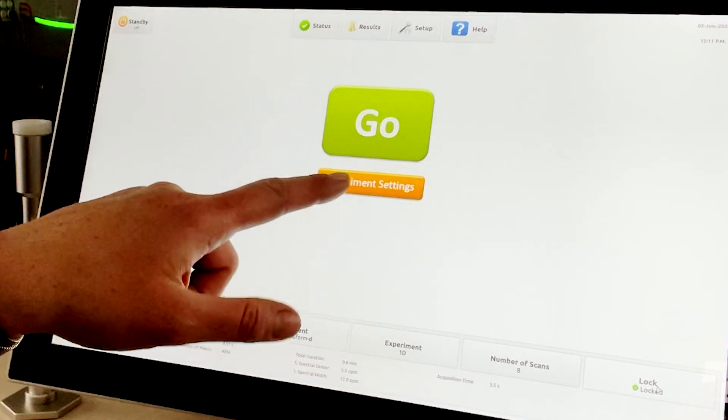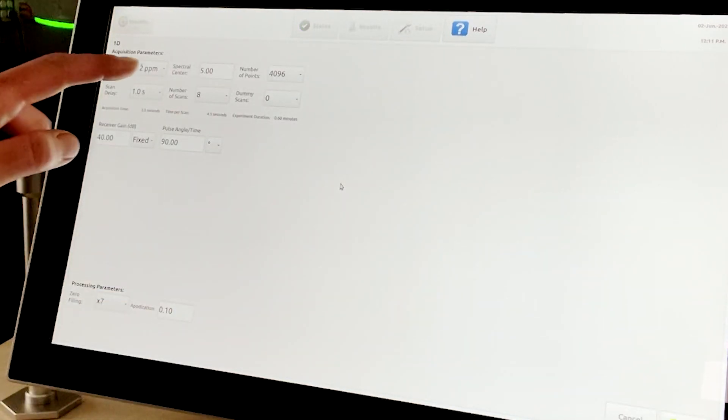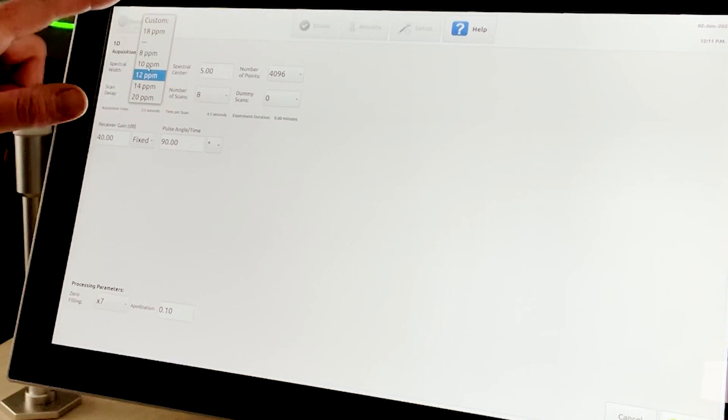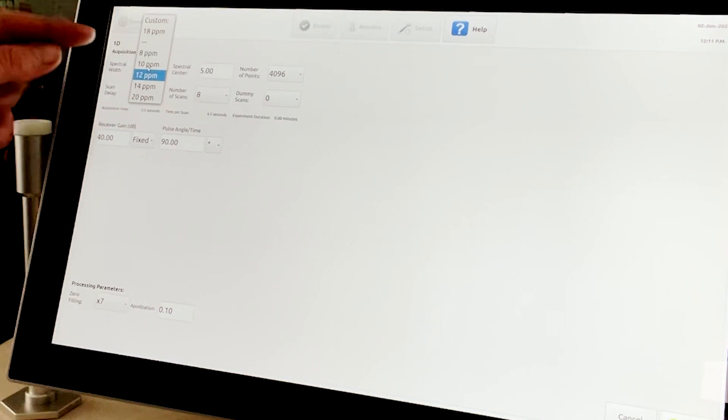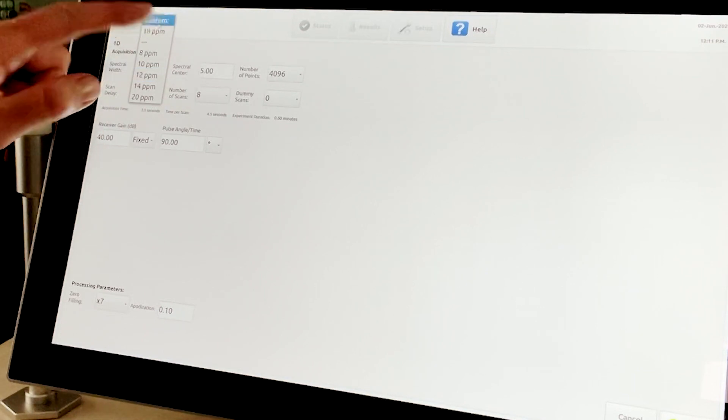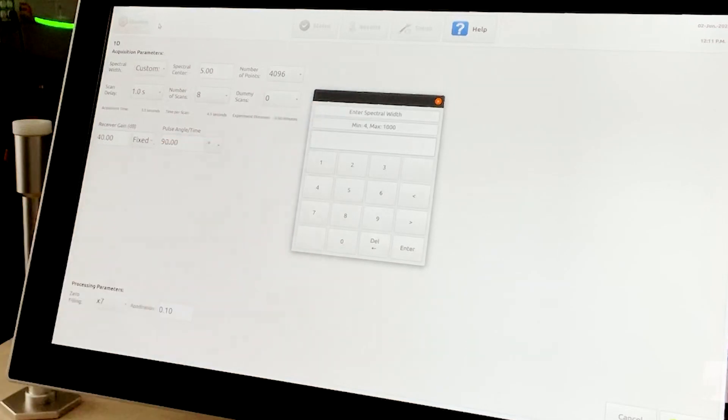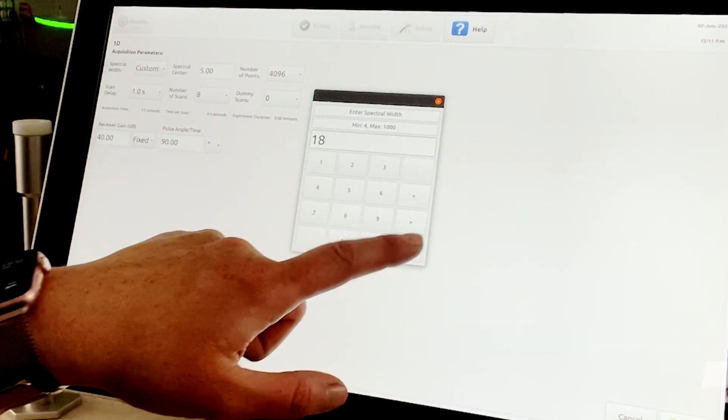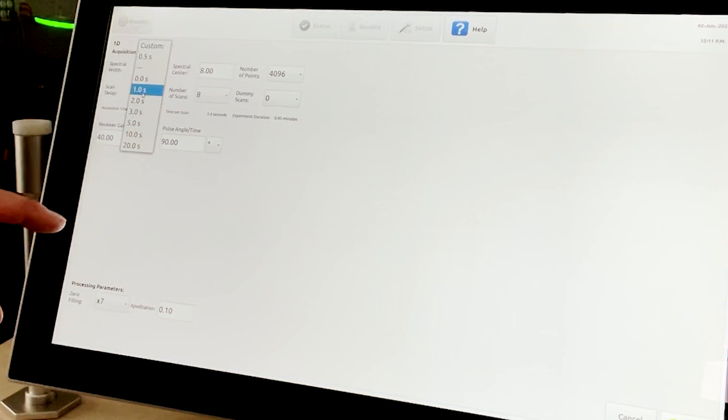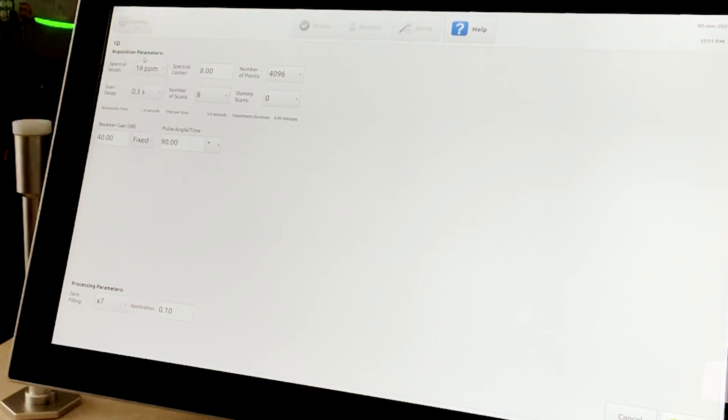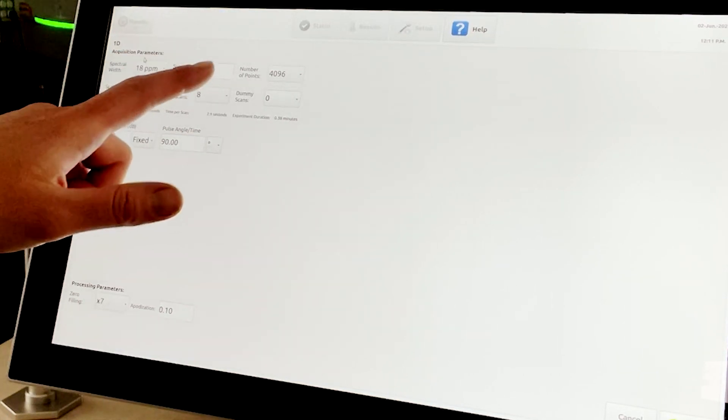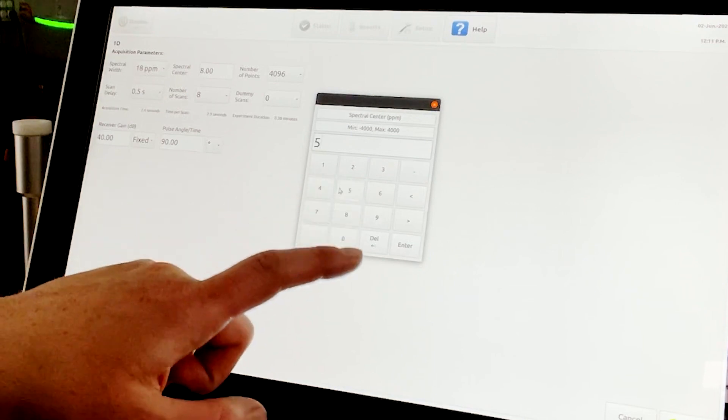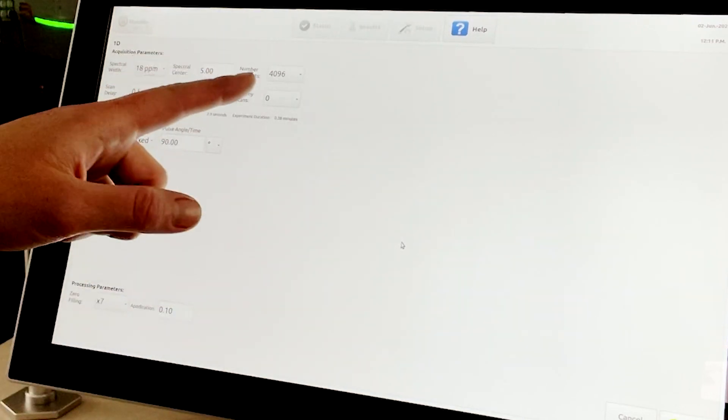If desired, the experiment parameters can then be further modified. For example, spectral width can be customized by using a series of pop-up menu options, again by selecting from the custom calculator, which will provide the min and max values available to the user. This can be done with scan delay, spectral center, number of scans, and number of points to ensure you have the desired acquisition time or time per scan.